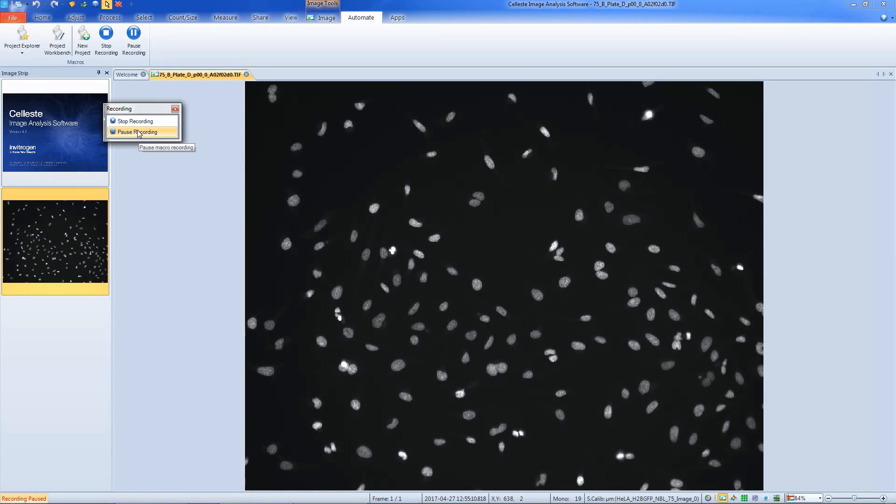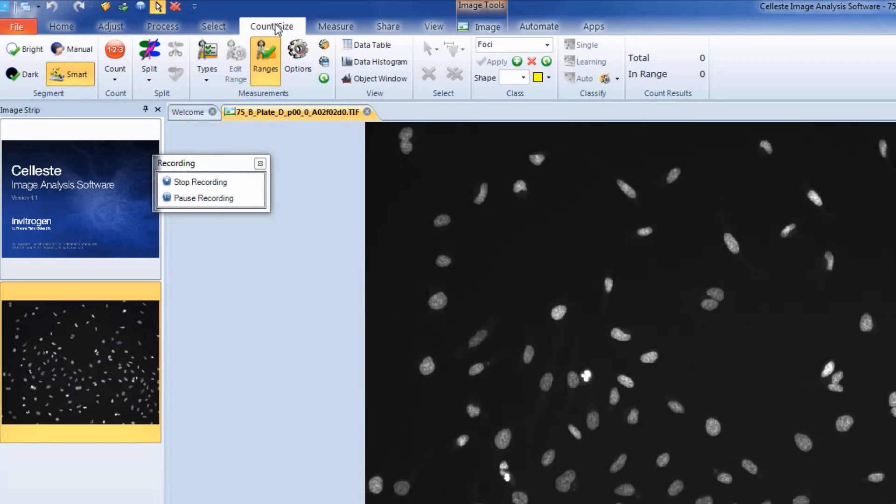In this example, we're going to be setting up a macro to perform a count using smart segmentation. First, we'll select the Count and Size tab.